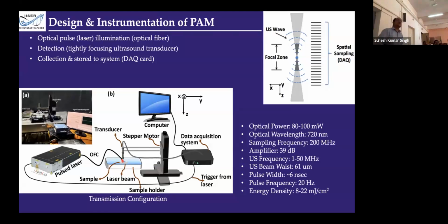Okay, this is the experimental system where light from the pulsed laser source is coupled to an optical fiber and illuminates over here, and then we acquire the photoacoustic signal by these transducers, which is amplified and then collected by the computer.